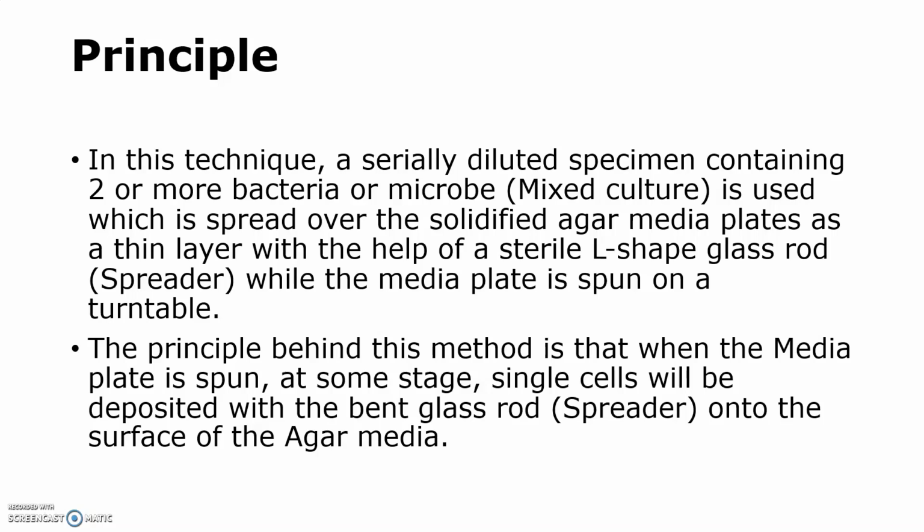It should be serially diluted, and it is spread over the surface of the solidified agar media plates as a thin layer with the help of a sterile L-shaped glass rod. Using this L-shaped glass rod, we spread it evenly on the surface as a thin layer, while the media plate is spun on a turntable. So we can either turn the table while spreading.